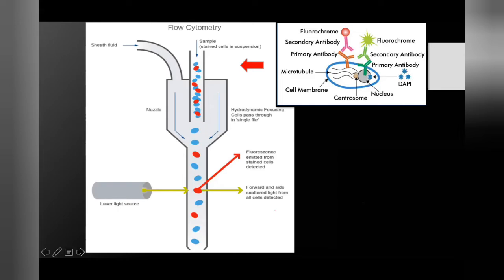You can also know whether that antigen is expressed appropriately or the density is reduced or increased. When a fluorochrome-tagged cell passes through the detector, the light excites the fluorochrome, which emits light of a certain fluorescence, which is again taken up by detectors. So we can know which antigen is being expressed, overexpressed, or underexpressed on a cell, right?